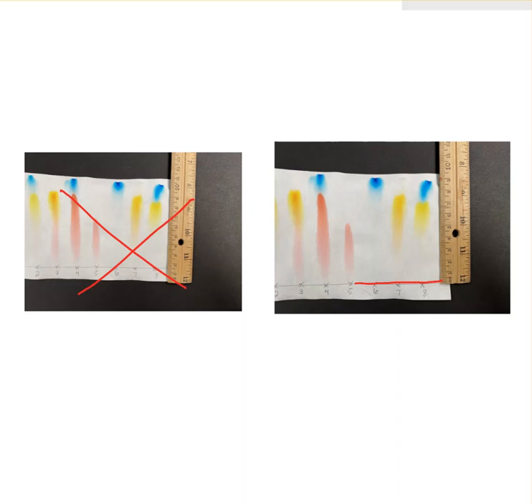And then also we're going to measure in centimeters. The centimeters have a mark every line, at least on this ruler they do. Every tenth of a centimeter has a line. But the thing is, these spots are so big and you're judging where the middle of it is. Really, this digit here is an estimate, and so it doesn't make sense to do another digit after that. And that's all you need to know to interpret your data.